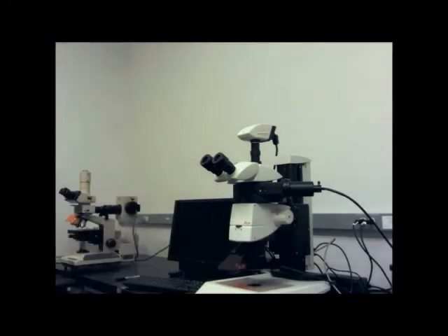Welcome to our microscopy room. When you come for your field trip, we'll be telling you about the different kinds of microscopes we use. The one that you see over here on my left is called a stereo microscope. And there's another one behind me, I think you can see it over here. That's called a compound microscope.